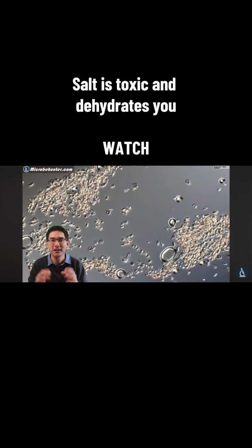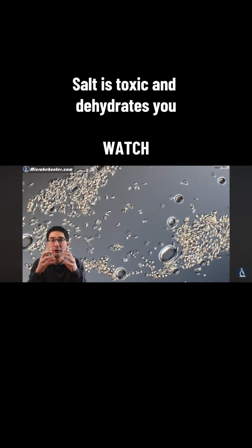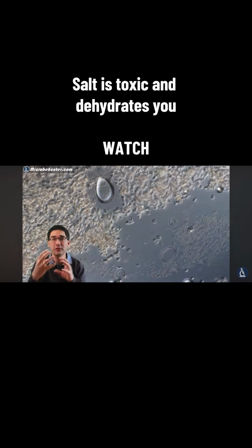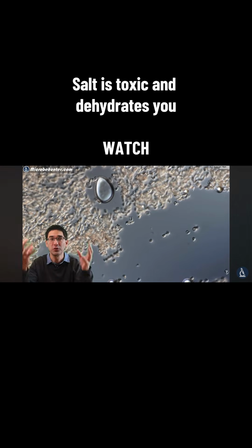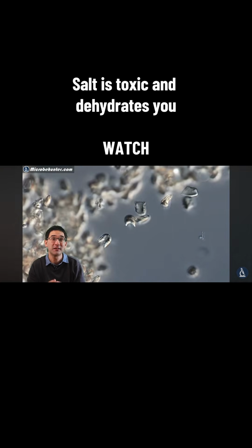Well, gone is the nice round shape, and the cells are much smaller right now, and they're kind of shriveled up a little bit and quite irregular because, of course, there are wrinkles, and because the central part of the cell started to shrink, and because the water was all removed. And of course this means that the cells are not able to transport oxygen anymore.